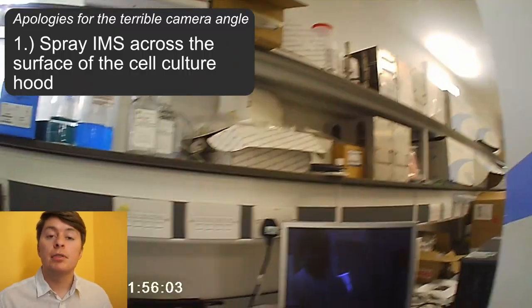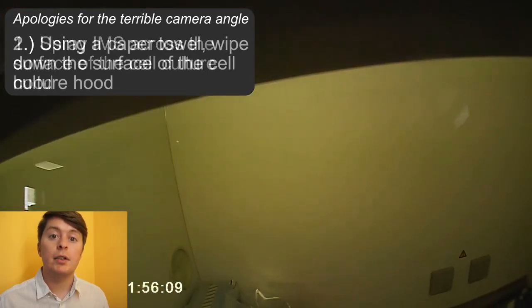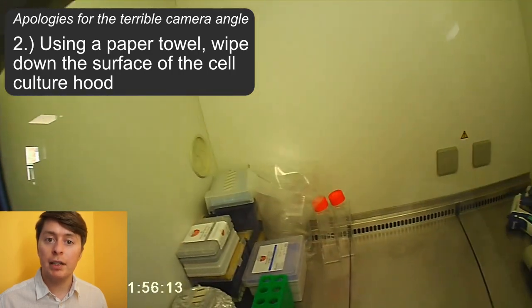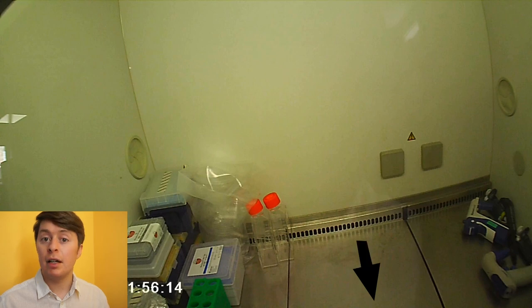One of the first things we also need to do is spray down our cell culture hood before we do anything inside. So the way we sterilize a cell culture hood is by spraying the entire thing with IMS, grabbing a paper towel and wiping it all down. And it is fundamental that we make sure that we have a clear path from the back of the cell culture hood to the grill at the front.